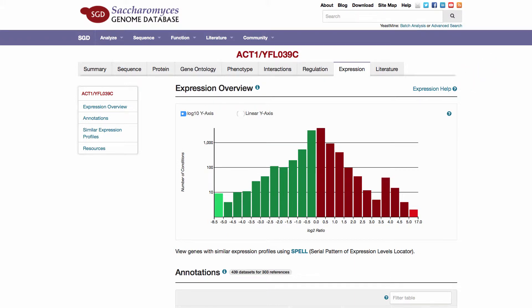An overview of the expression data is presented in the form of a histogram to graphically represent the distribution of data from the large number of available microarrays. The data in the histogram represents log2 ratios shown here on the x-axis, that have been grouped together into ranges and plotted against the number of conditions shown here on the y-axis.